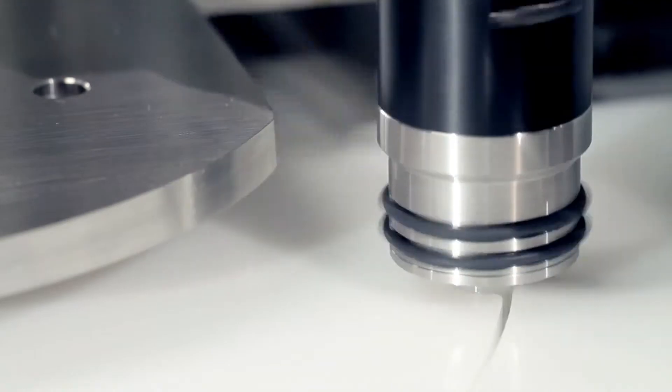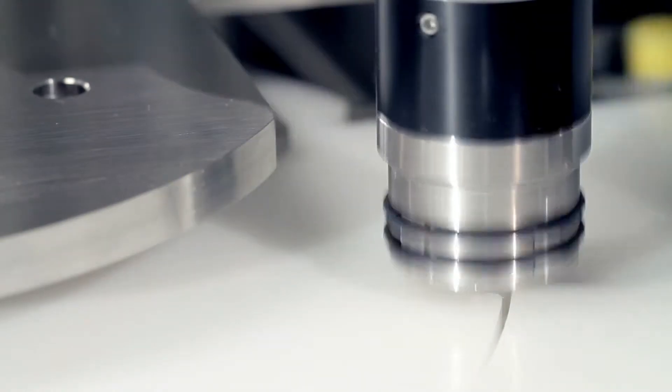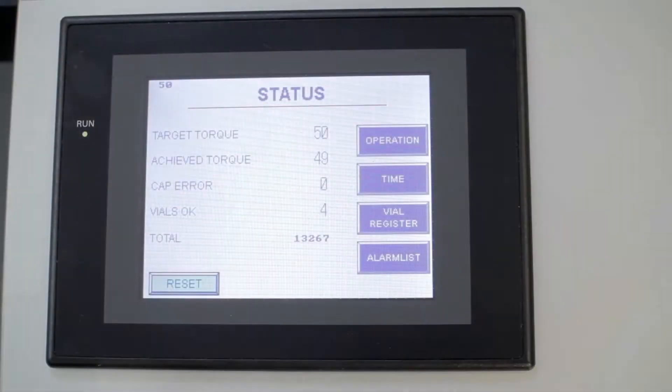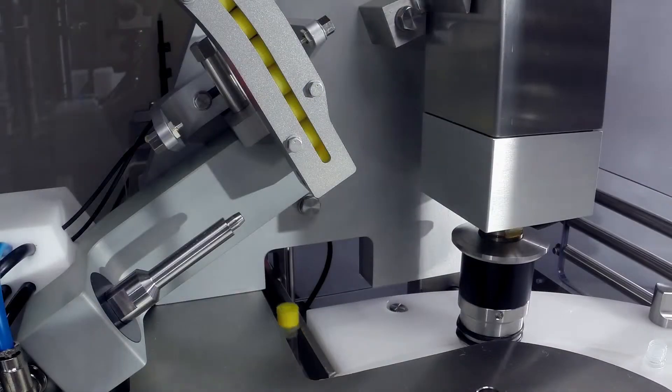Capping torque is precisely controlled and monitored. This prevents leakages due to fluctuating air pressure in storage or transit and ensures customers benefit from an easy process validation.